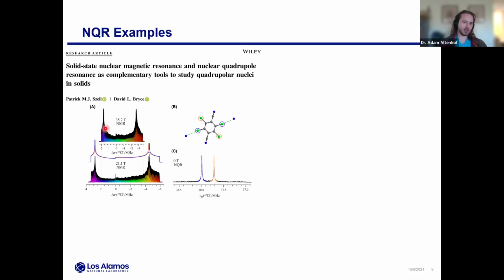Again, these really broad powder spectra can, in fact, resolve the 2 sites, though I'll note this is potentially a time-consuming experiment. You also have to be a little careful to ultimately resolve that. But I believe using the same probe, just pulling it out of the magnet and doing the zero field NQR, you can see this really nice regime, right? You just get 1 peak per site. Again, something like what most spectroscopists are looking for.